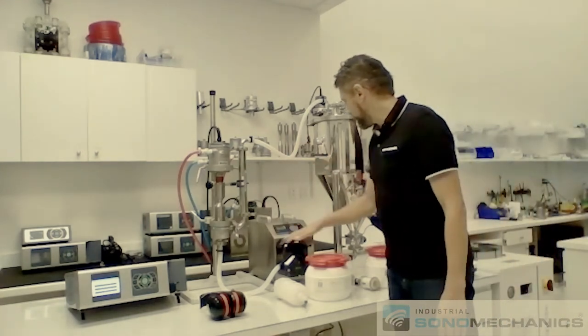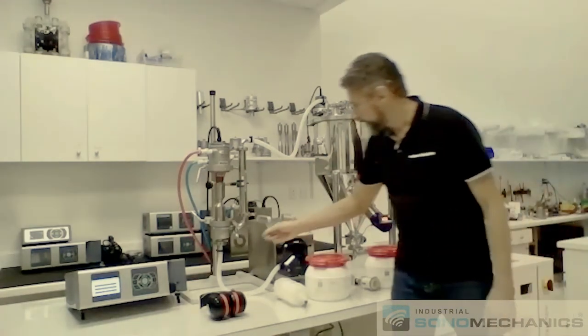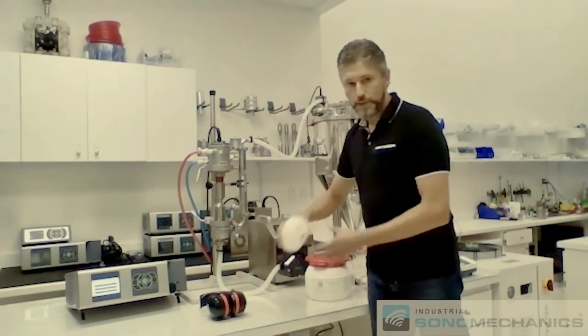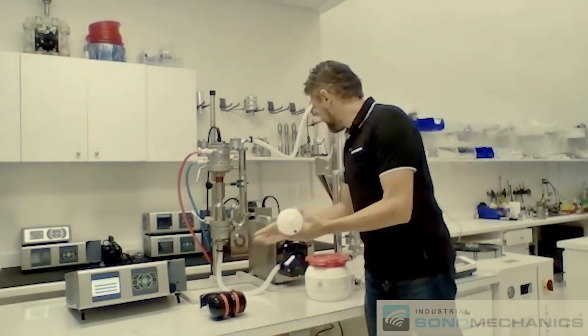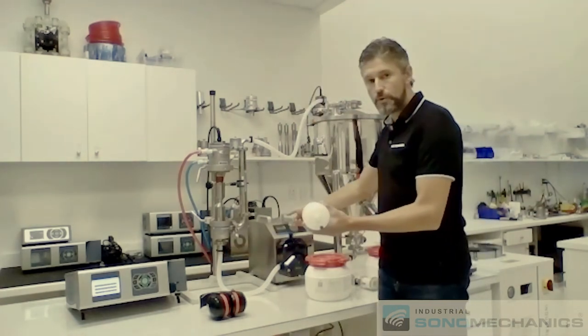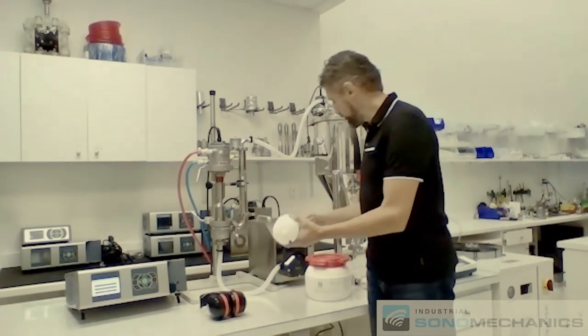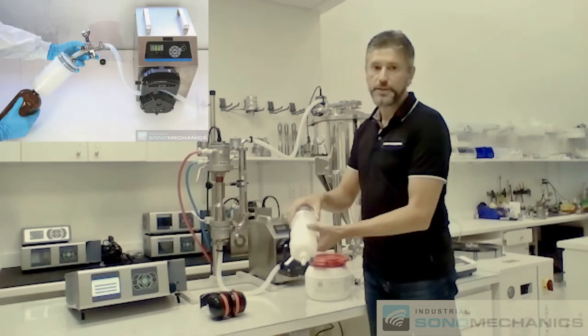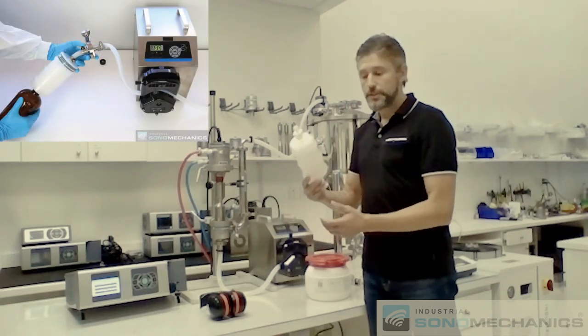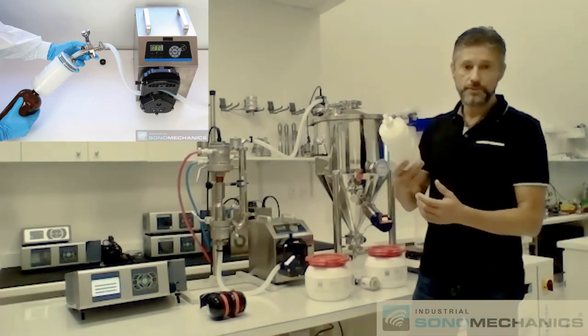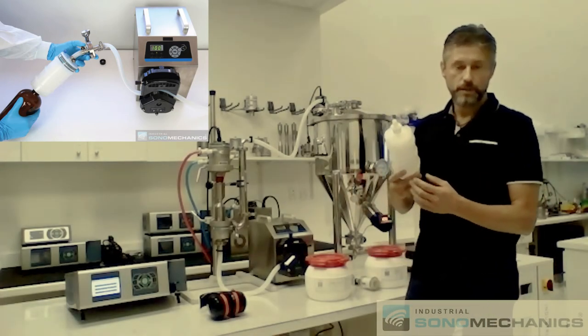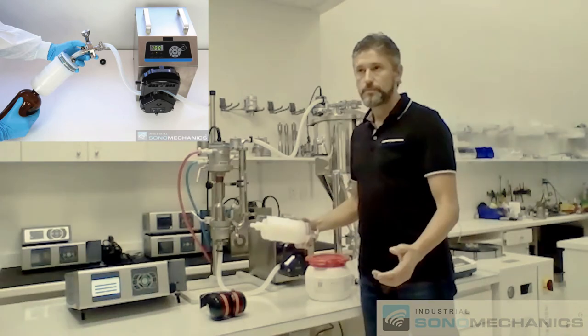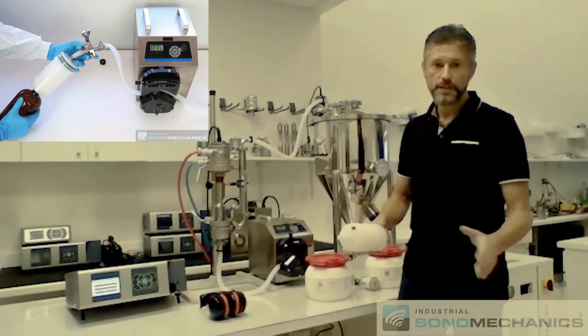So once the process is done and you've collected all your liquid here, you will disconnect the line from here. You will connect it to this filter. You'll again reverse the flow and slow it down. And then you'll just pass all of this liquid using this pump through this filter into your finished product container. The filter is there to sterilize your nanoemulsion. This is a sterilizing filter, 220 nanometer pore size. Once the liquid passes through this filter, it's sterile. You collect it in the finished product container and you're done.